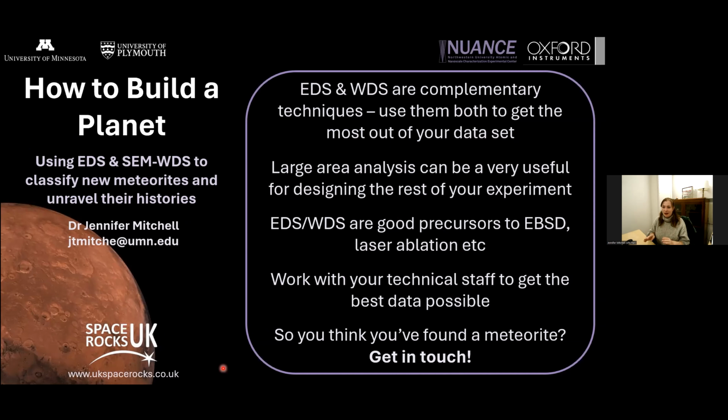Do your non-destructive analysis first, please. I have lots of users come to me and they want to measure things, but they've done laser ablation and the mineral they want to measure is no longer there because it's got this huge crater in it. So make sure you do this first and then take that data and apply it to your EBSD, apply it to your laser ablation and use it in conjunction with the other techniques. Work with your technical staff.